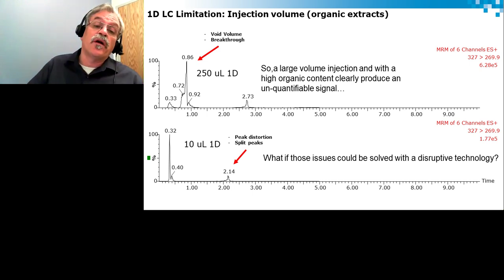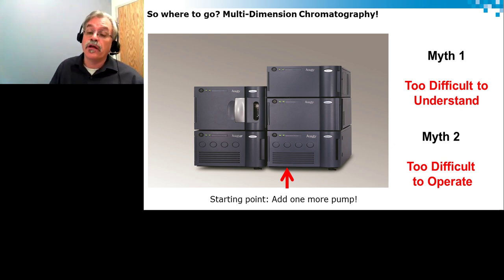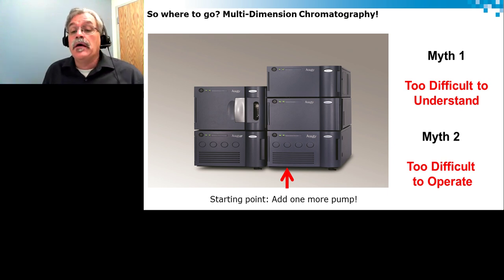And this is actually where, on these slides here, you're going to see that multidimensional chromatography, by adding extra fluidic circuitry and also adding extra components, will bring a novel aspect that a user can introduce or include in their workflow. However, multidimensional chromatography is not a new technique per se. It is a technique that's been around for decades, but it actually has a very bad reputation.